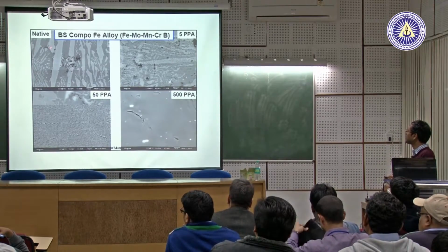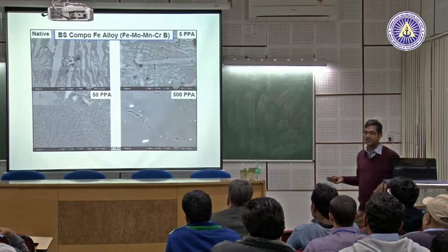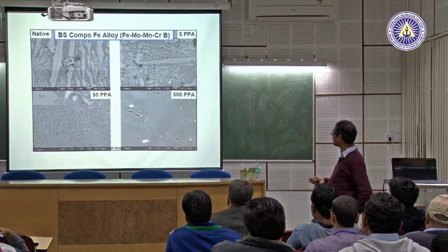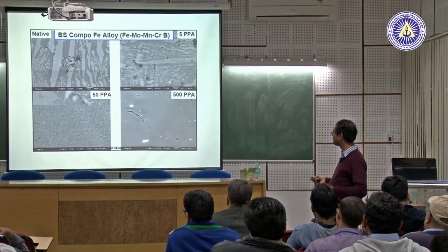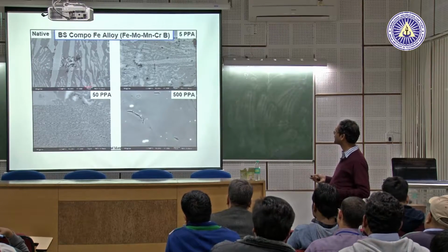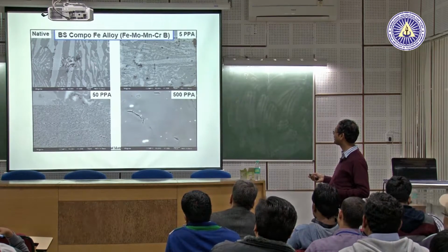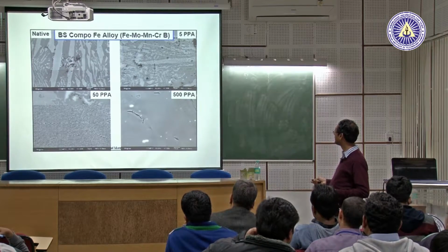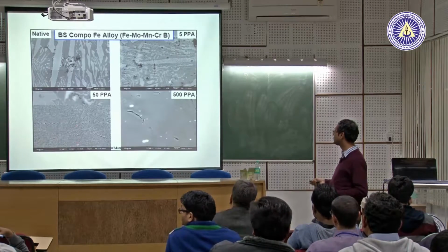This is different levels of coating. Sometimes your sample will look like this also. Why? Because it has been scanned, but this area could not be properly scanned because of the charging problem. This is actually a backscattered image. You can see different phases here, white and grey and black are present. Here you don't see anything, here something is there but not clear.